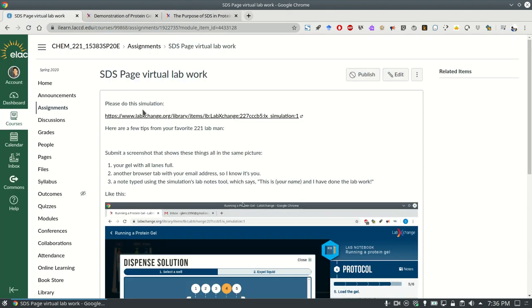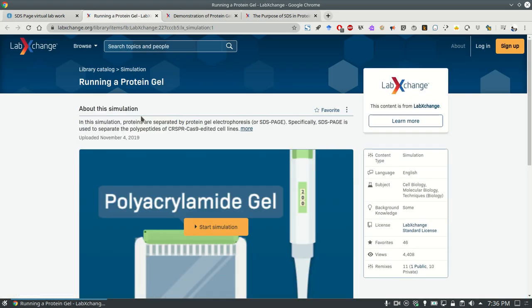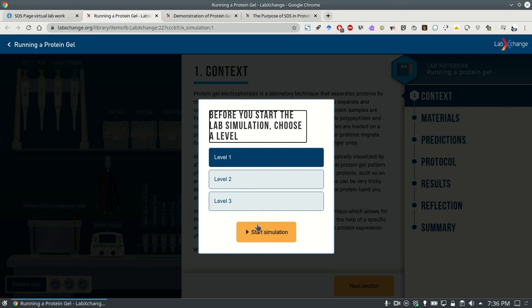Hi folks, I just want to give you a few tips about how to do this virtual lab. It's just like the last video from the pre-lab homework where the guy goes through all the steps on how he does his gel, except this is just a simulation rather than the real thing. So we do everything he does except we do it online.